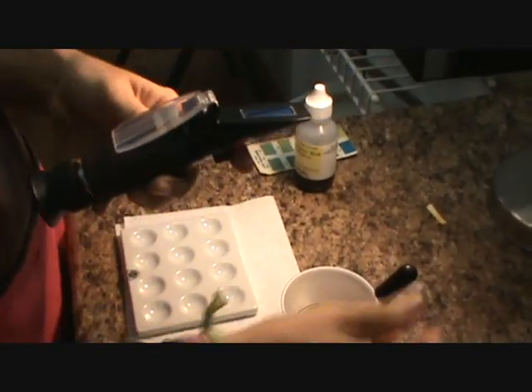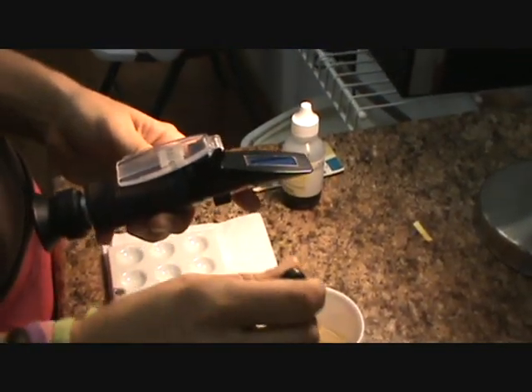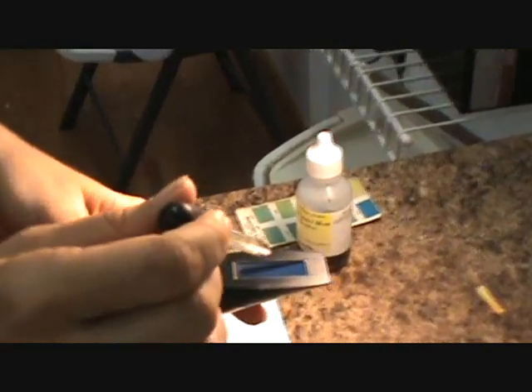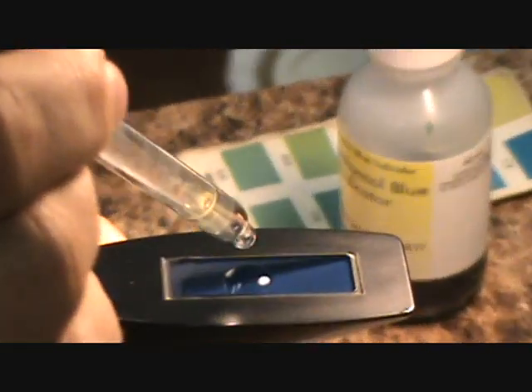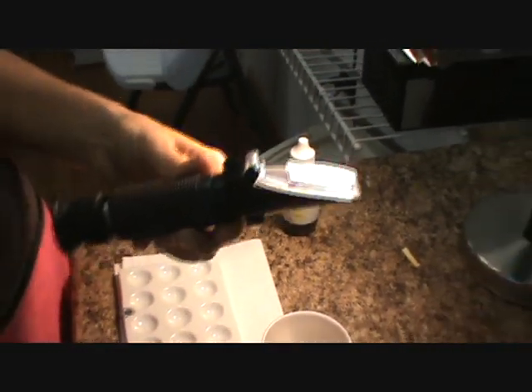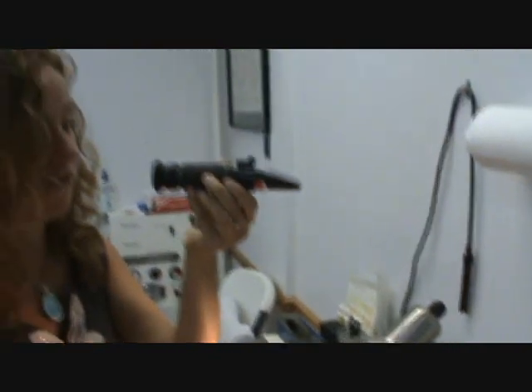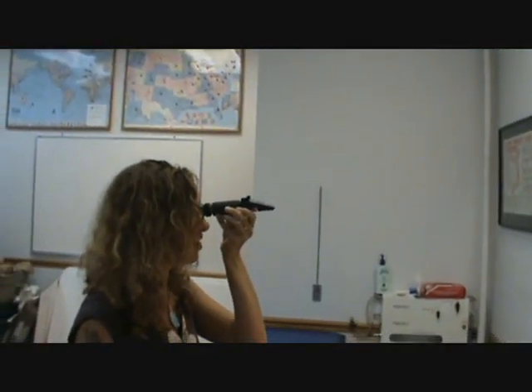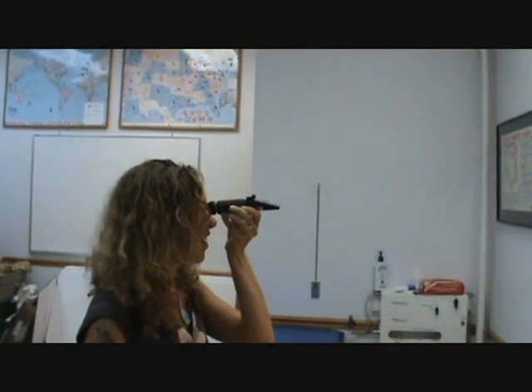So the first thing we do is we're going to test the sugars. You're going to have some fresh urine, and we're going to drop about two or three drops of urine onto the glass here, then drop this little lid down on top, push it down to make sure it's sealed, and then look through the refractometer. It's good to look at a light source so we can see what it is.